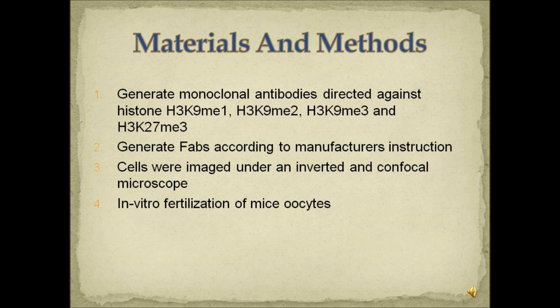Next, the cells were imaged under an inverted and confocal microscope. Cells were placed on a glass dish with a cover slip, and fluorescent Fabs were pipetted on the cover slip. It was then placed under an inverted microscope.